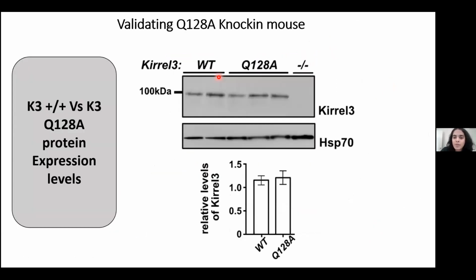And when we used Western blotting, we saw that there was no difference between wild type and knock-in mouse in terms of total protein levels, as that's what we expected.